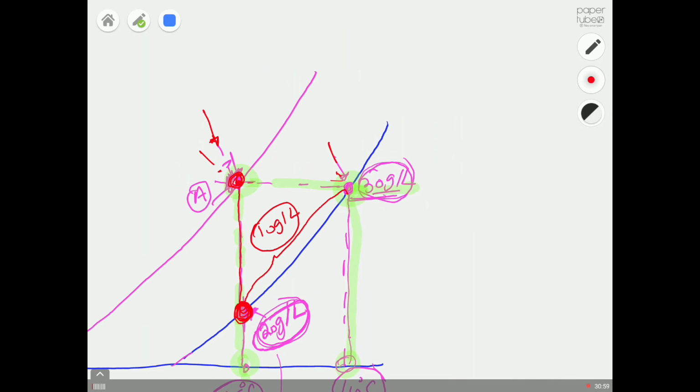The solution is completely cloudy, which means you might have millions and millions of crystals. So you have already lost control over the number of particles, and you also don't have control over the size of your final crystals, and you also don't have control over the size distribution of the crystals. And industry people, they don't like it.